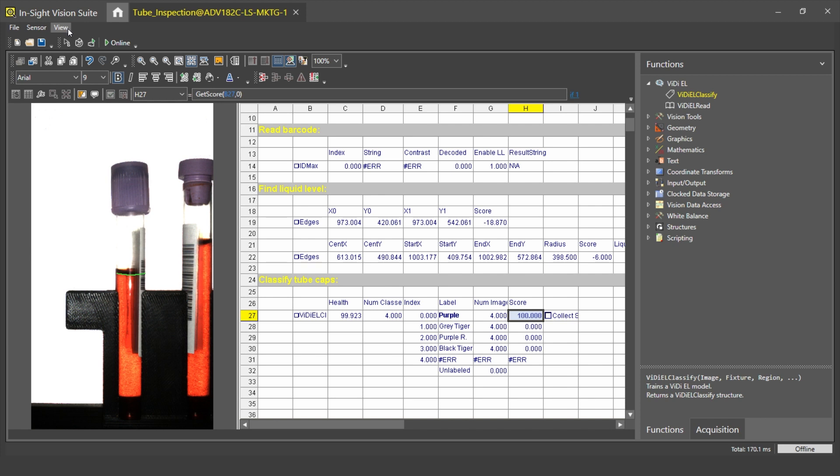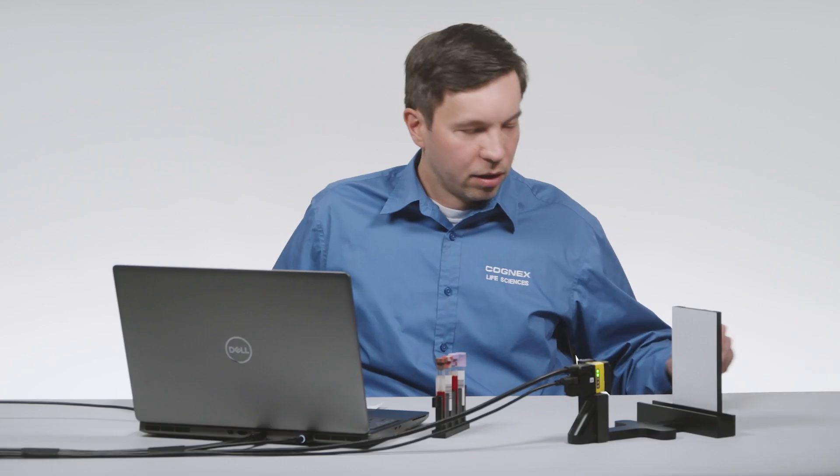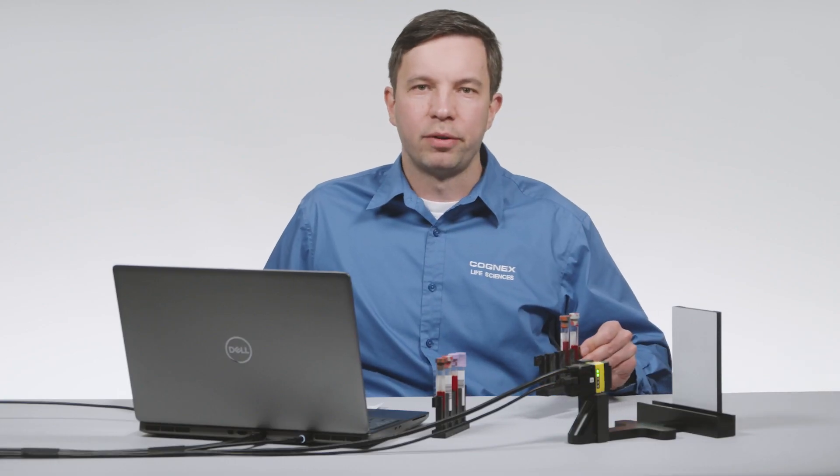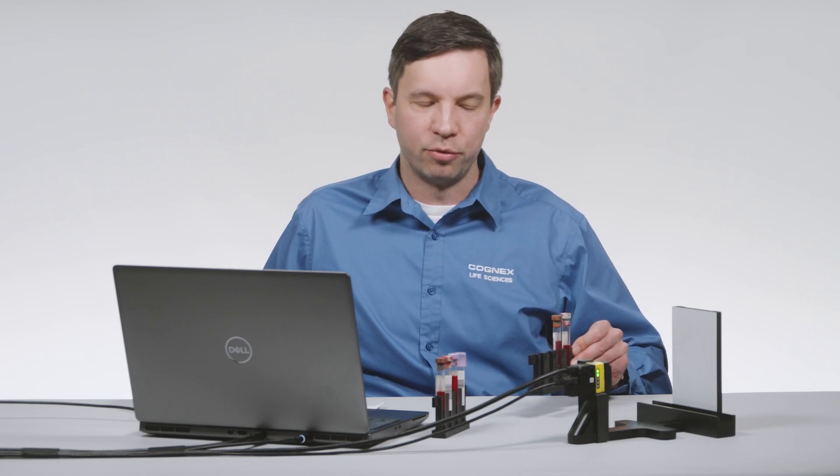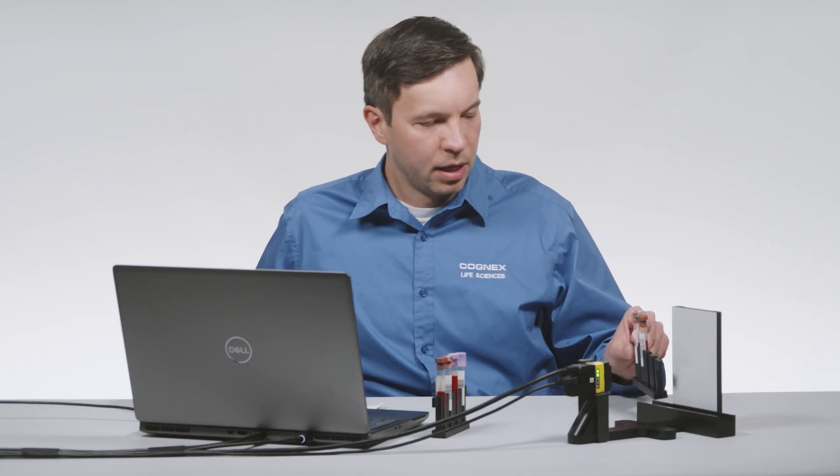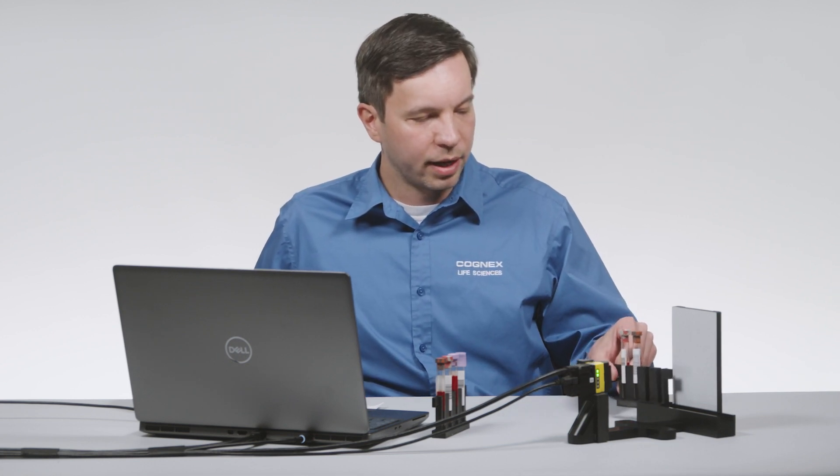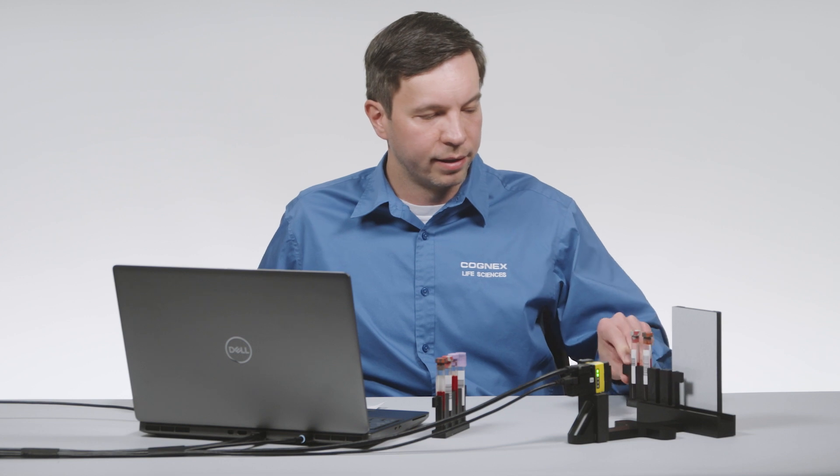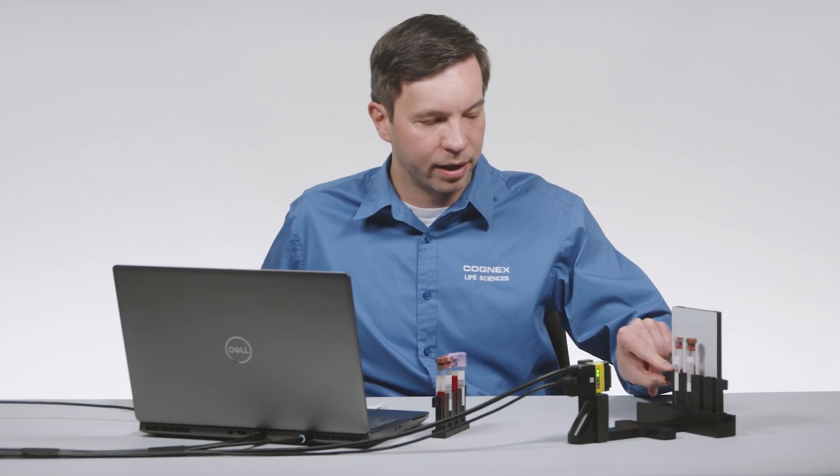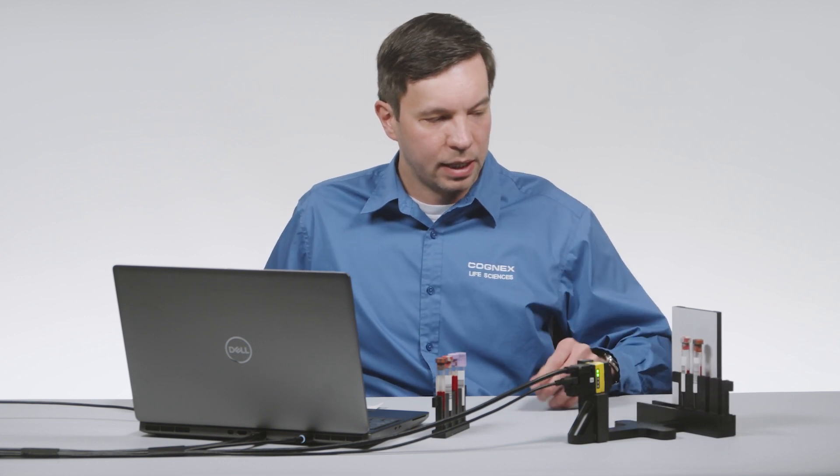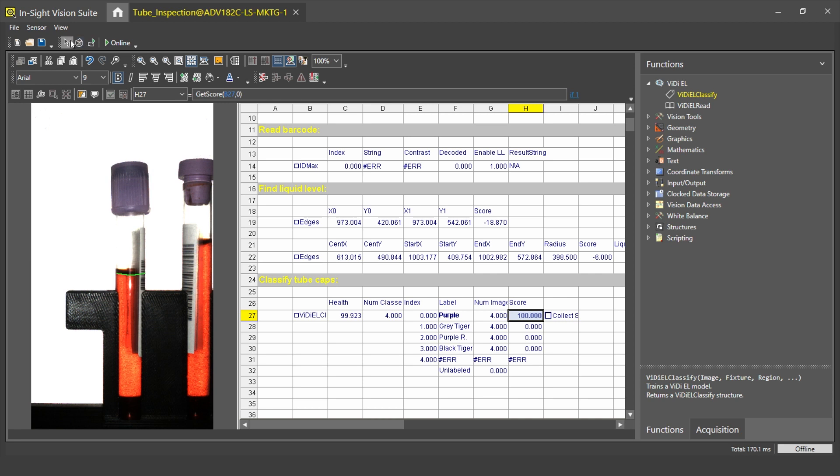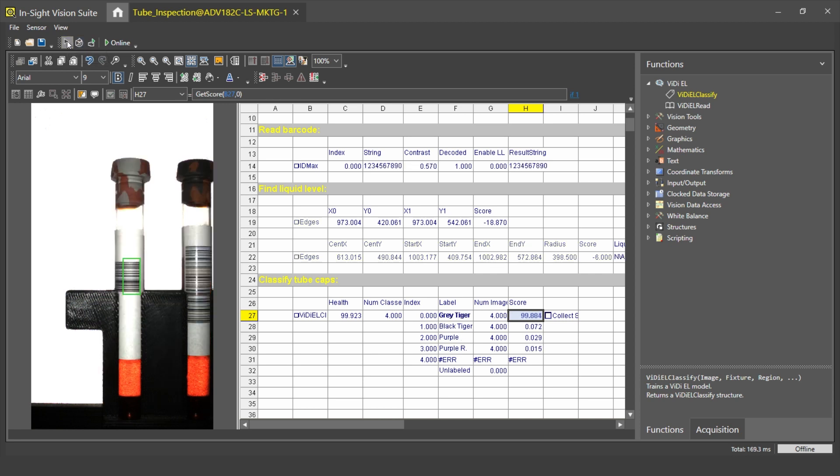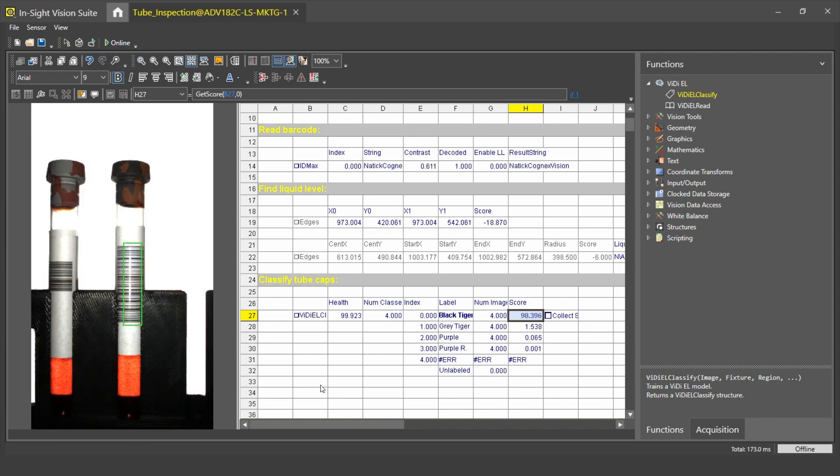Next, I will test how the model can tolerate the variances. For this, I have different tubes that were not used for model training before. This small rack has a gray and a black tiger cap. As these have higher variances, this is a good time to test our model robustness. As you can see, the gray tiger cap was predicted with high confidence by the model. If I test the black tiger cap, it's also detected with high confidence by the model. The model works as expected.